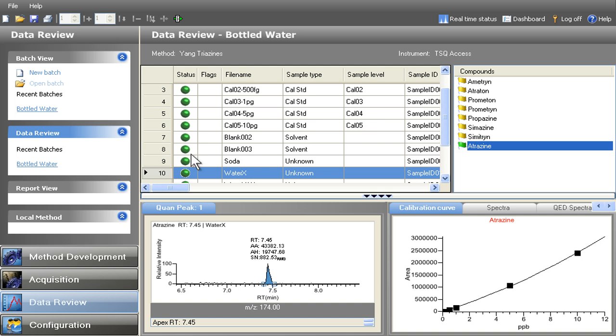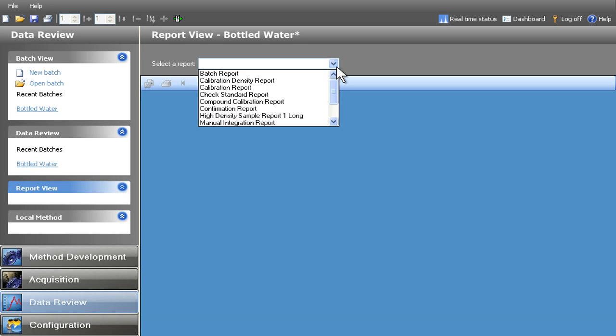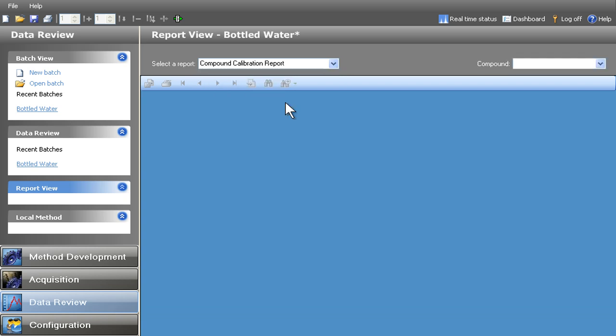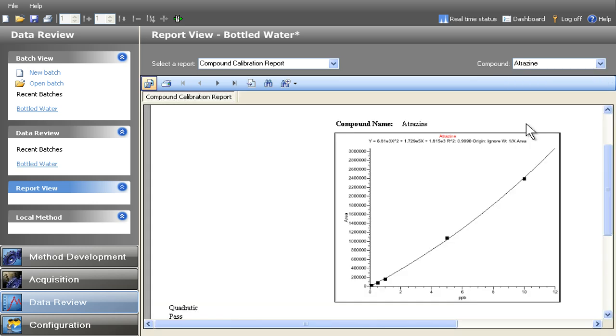With TraceFinder, the reporting process is simple and efficient. By seamlessly linking the report view to the data review page, users can easily move back and forth from processed data to a report. Any changes made during data review are instantly reflected in the report, eliminating the need for reprocessing the data.